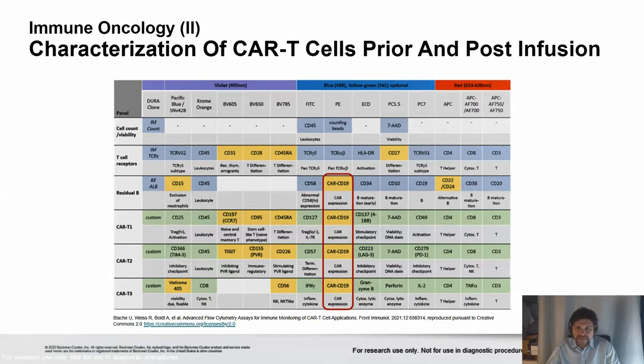You see there are some lines that have blue cells. These blue cells represent the constituents of a catalog DURAClone tube, so something that you simply could order like a single antibody. And the lines with the green cells would represent dry formulations custom made for this purpose here. You see there are yellow cells in all the lines. Yellow cells would represent the drop-ins that were used in order to adapt the framework that was there already, either by catalog or custom, to a specific research question.